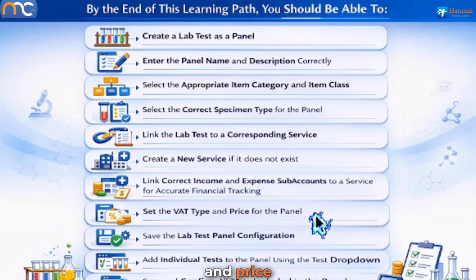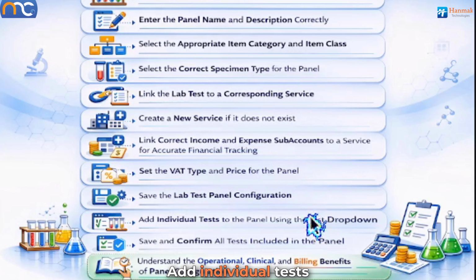Set the VAT type and price for the panel. Save the lab test panel configuration. Add individual tests to the panel using the test drop-down. Save and confirm all tests included in the panel. Understand the operational, clinical, and billing benefits of panel configuration.